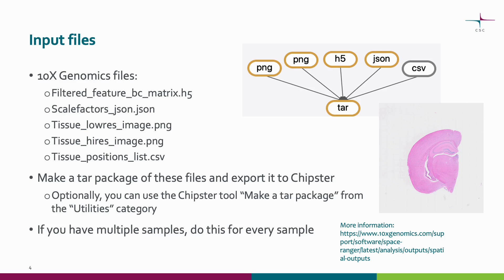Let's now take a closer look at the input files for this tool. You should give a tar package that contains these five 10x Genomics files. The first input file is the filtered feature barcode matrix in HDF5 file format. Make sure you use the filtered feature barcode matrix as opposed to the raw one. The second input file is the scale factors JSON file that contains the necessary scaling factors and numbers of pixels.